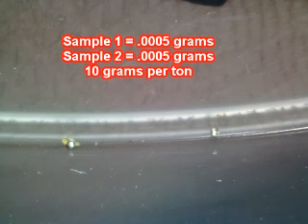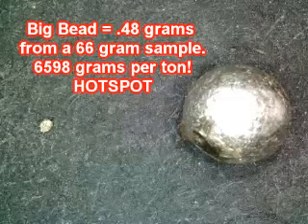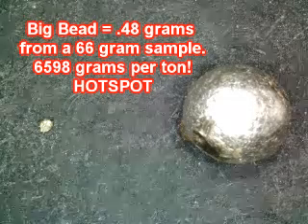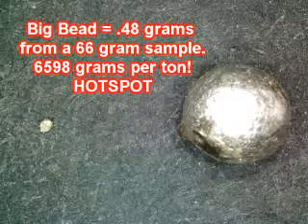These didn't go into the nitric — there was no sense in it because the color composition was dead on with every single test I have performed on this ore. I put them under the microscope — didn't get a measurement, but they're quite small. About 10 grams per ton of precious metals.